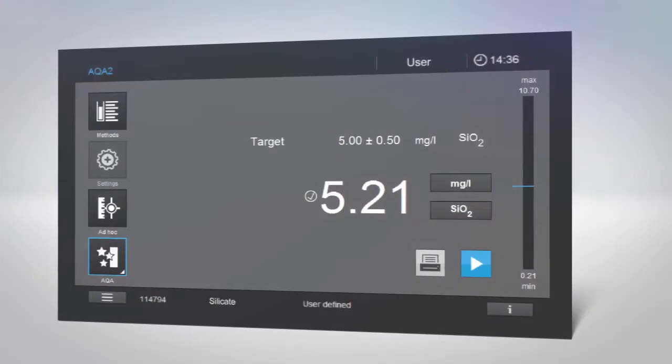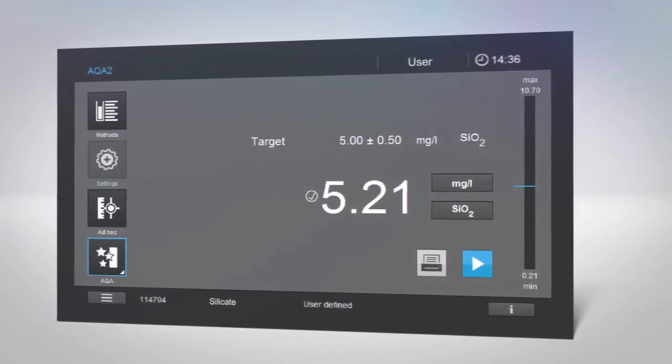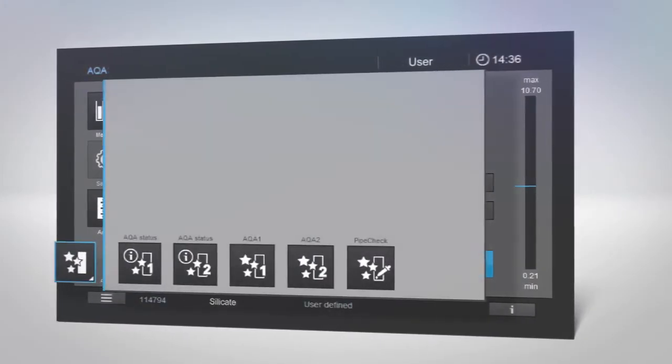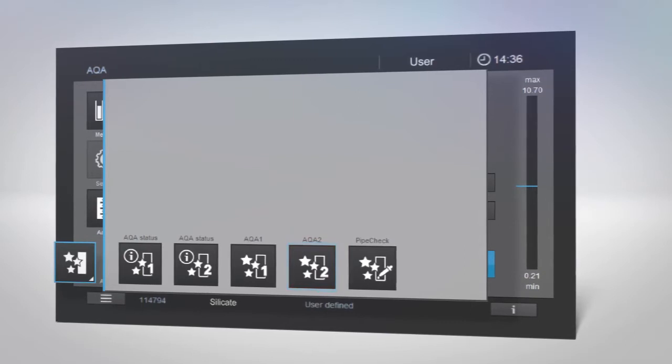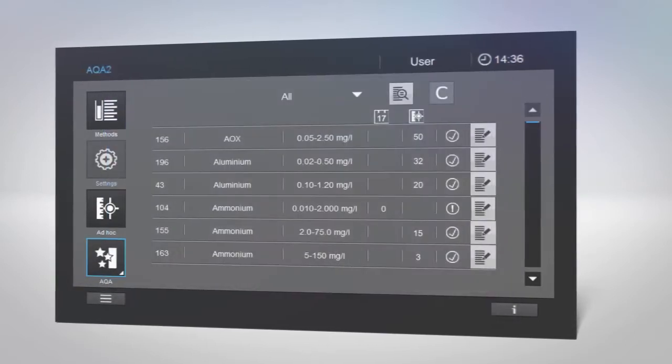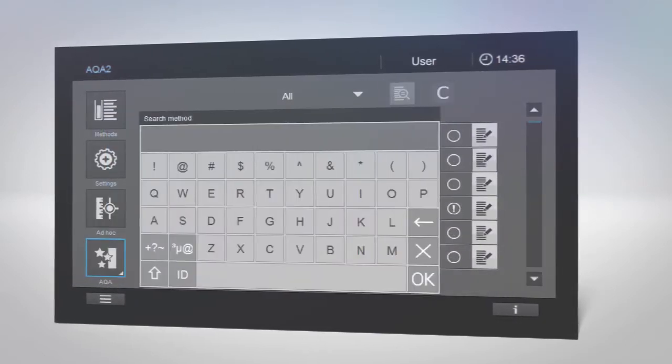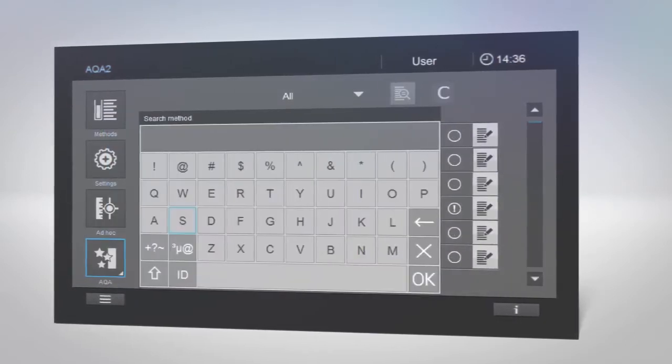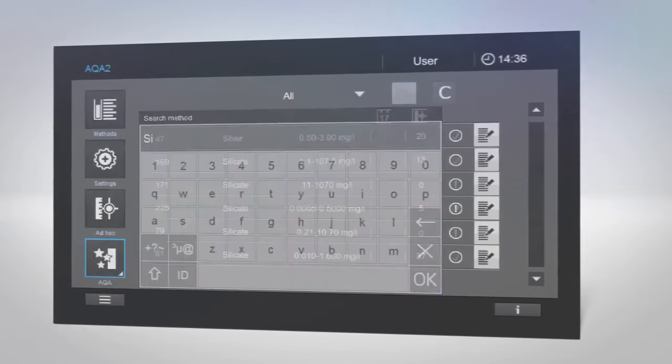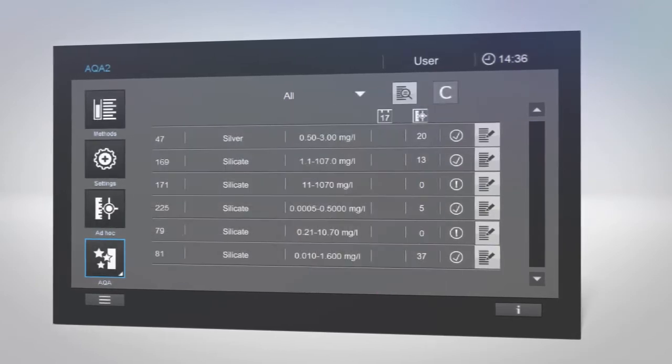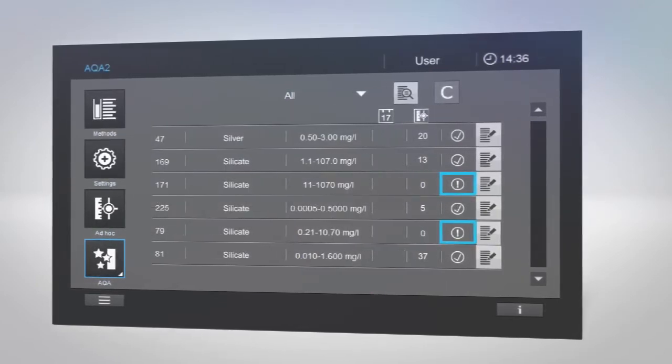To check the status of an AQA for a specific method, go to the AQA menu and select AQA2. Using the name search, enter the name of the method. If the AQA for this method has expired, you will see an exclamation mark.